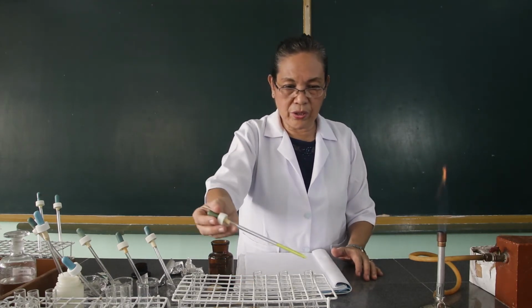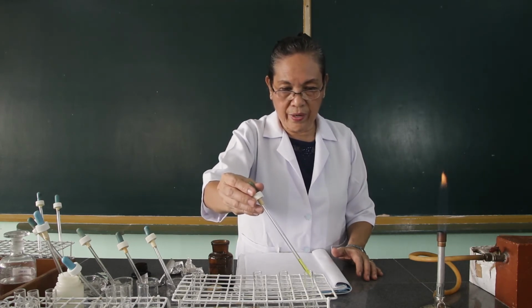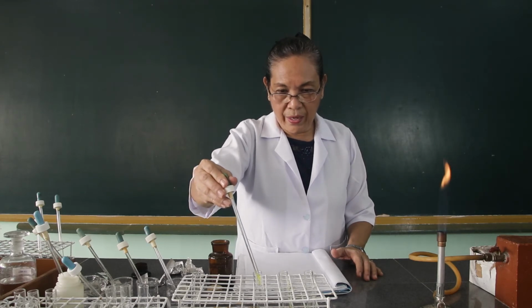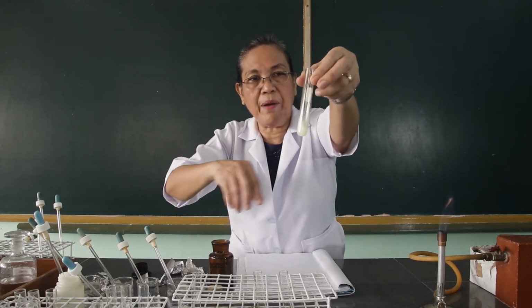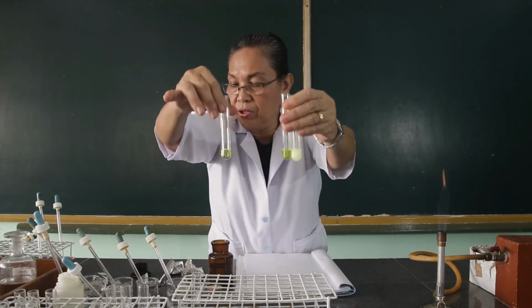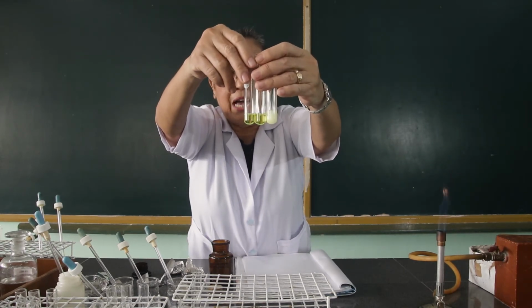Observe what happens. 1, 2, 3, 4. Remember, this is barium chloride. This is calcium chloride. And this is strontium chloride. Now, I want you to observe what happens.